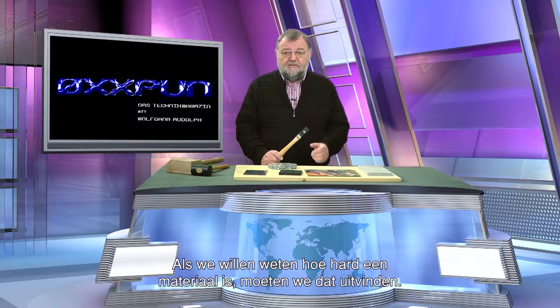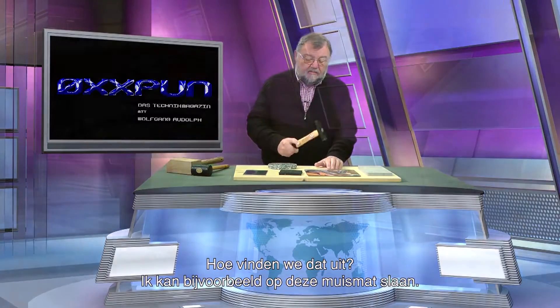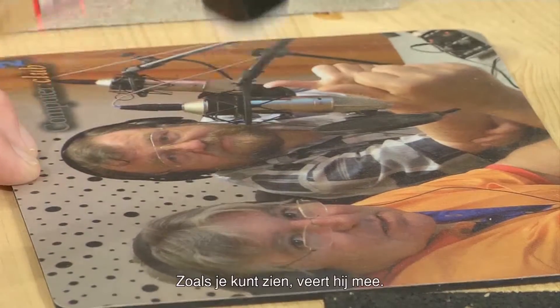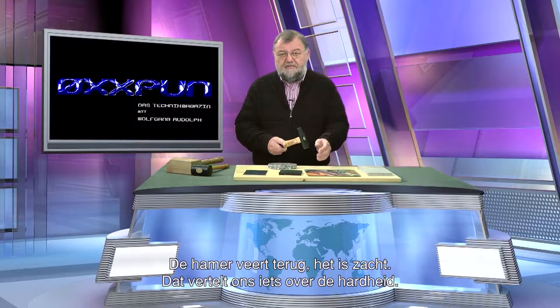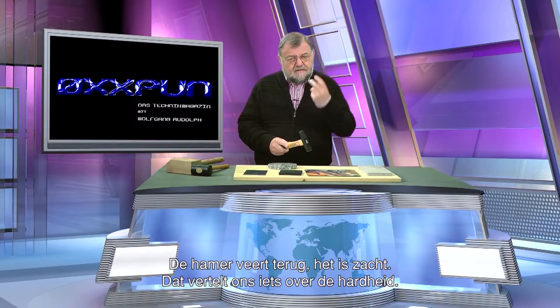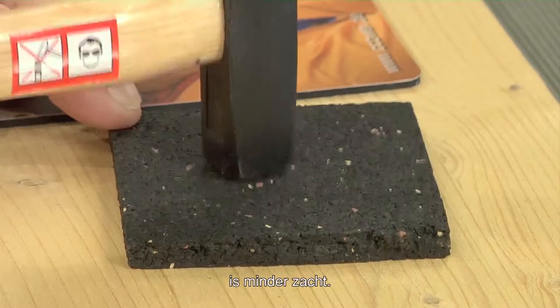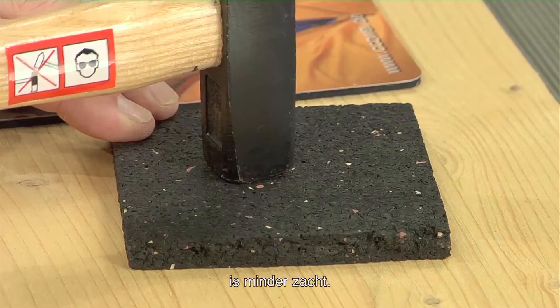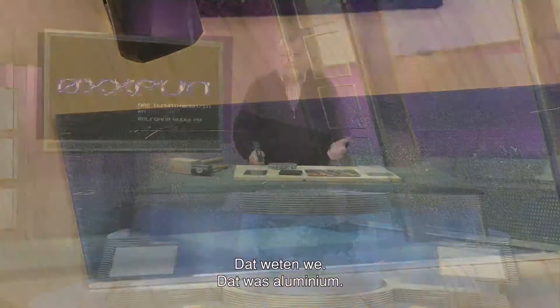When we want to know how hard a material is, then we have to find that out. And how do we find it out? I can, for example, hit onto this mousepad, and as you can see, it jumps — the hammer springs back. It is soft. That tells us the experience. Shock-absorbing material like under a washing machine — that is not as soft. Metal, that is hard. That we know.